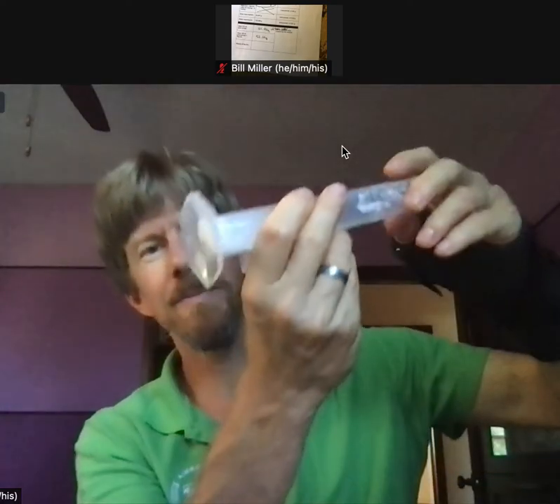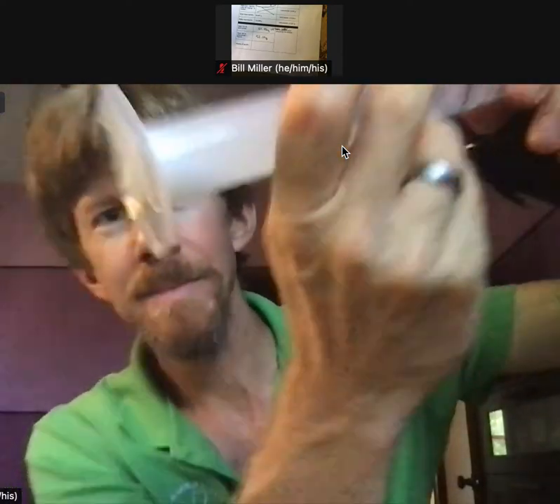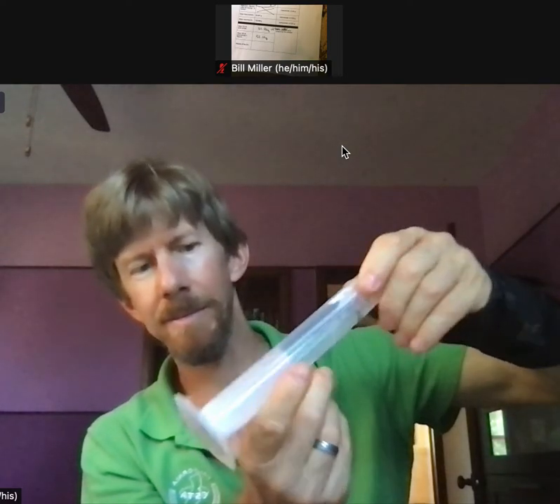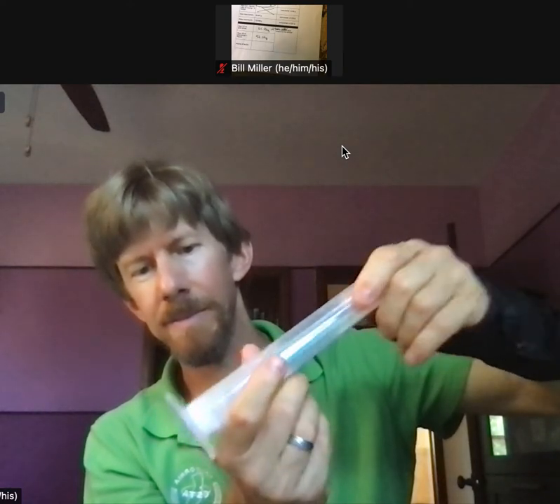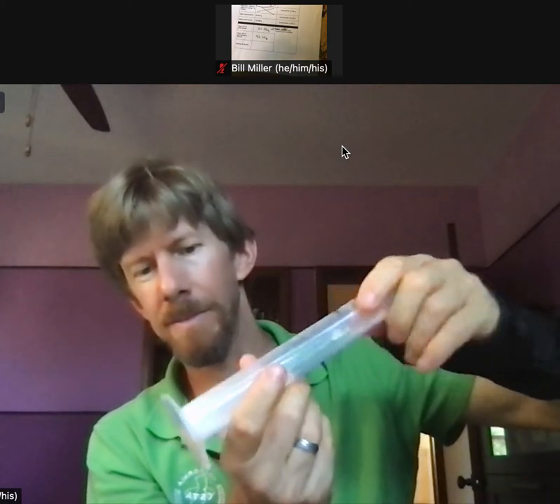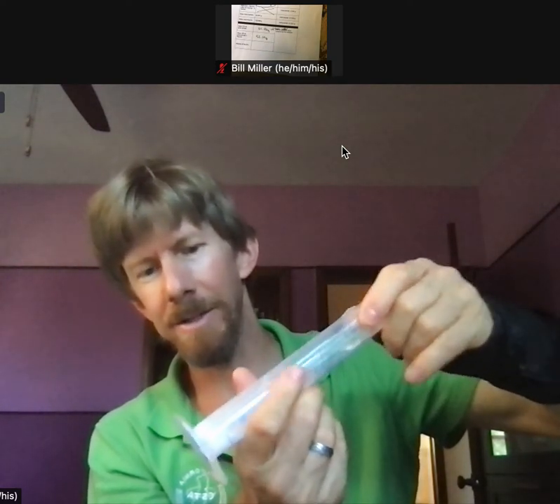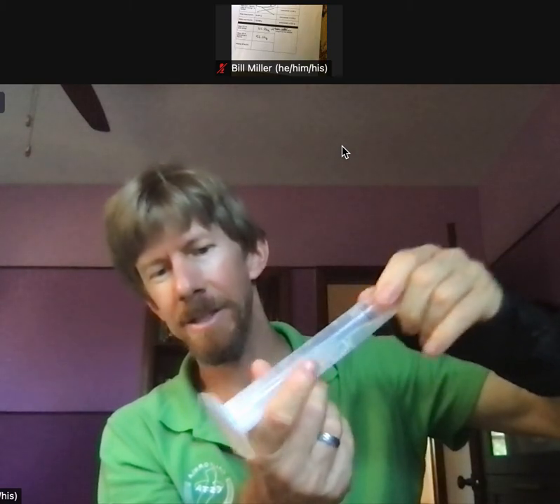Keep moving around there. See, if I move it like that, at least I get the solid moving. Otherwise, it's just sitting there. And I want it to move, because moving is how it's going to dissolve. And it's going to take a few minutes. Dissolving takes time, apparently. Well, I think that's all we're going to do for the rest of this video, so feel free to dissolve as well with me.